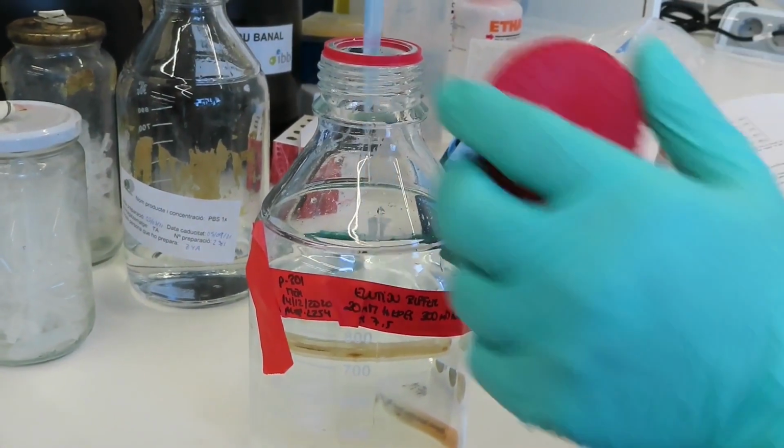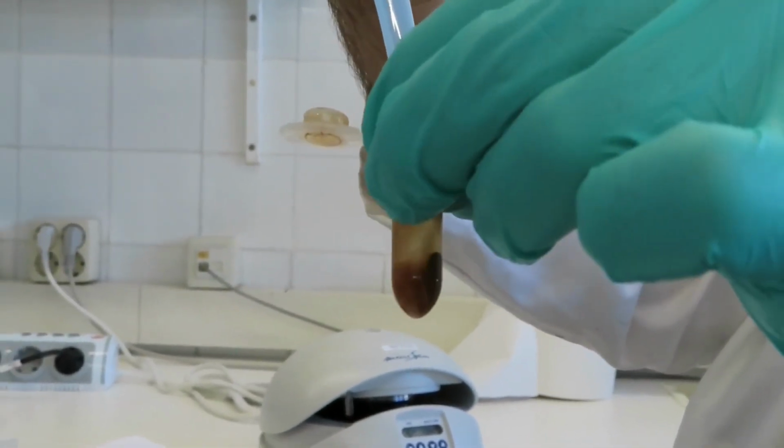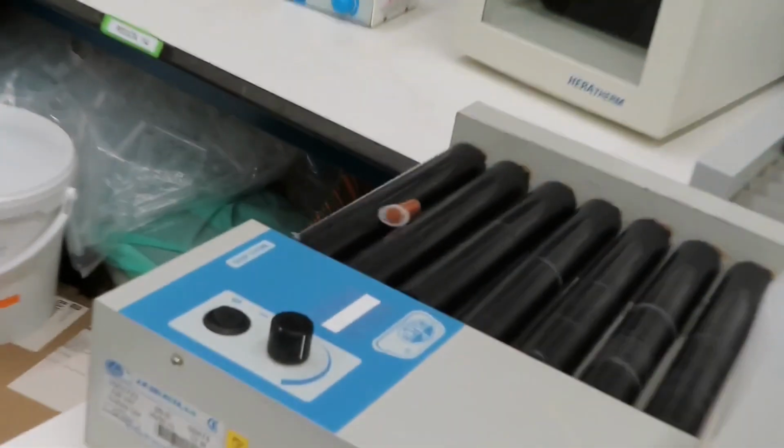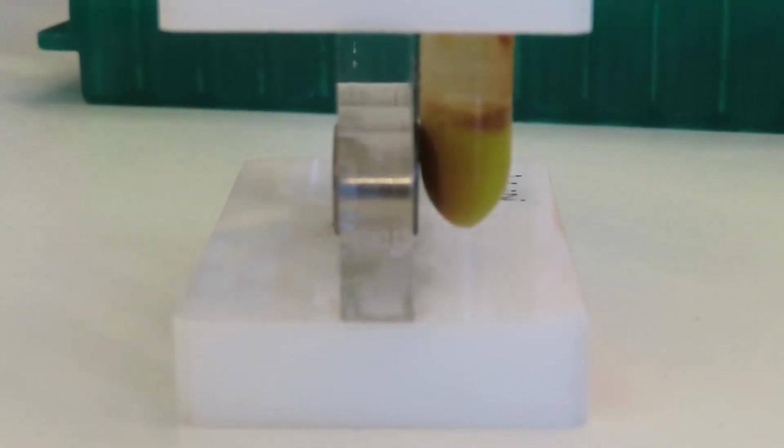Now is the moment to carry out the elution of the specifically bound protein. The elution buffer is added to the beads and incubated under agitation for 5 minutes. Pay attention to the greenish coloration of the eluted sample.